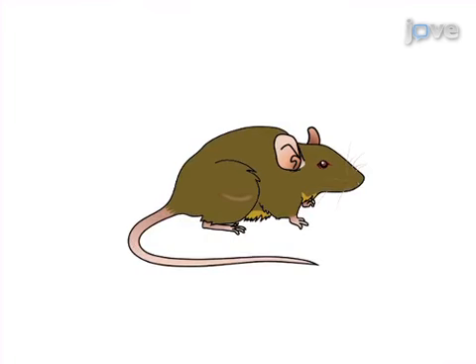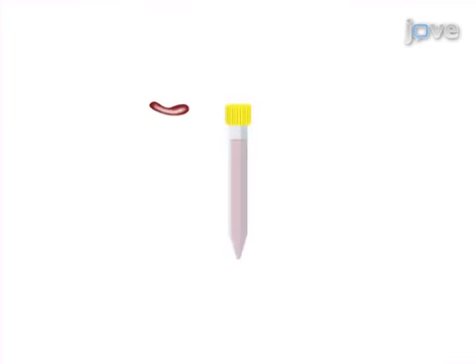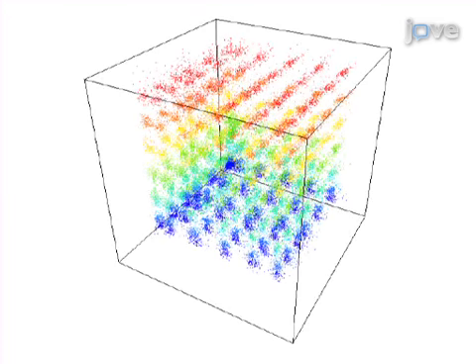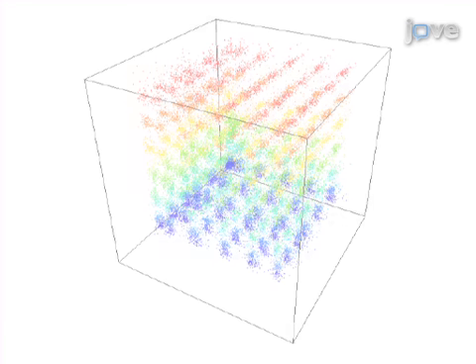The final steps are to harvest the fluorescent tag array cells from specific tissues, label them, and assess for MHC peptide-specific responses. Ultimately, flow cytometry results can show CTL responses by measuring target cell death, and they can show CD4-positive T helper responses by measuring B-cell target upregulation of activation markers.